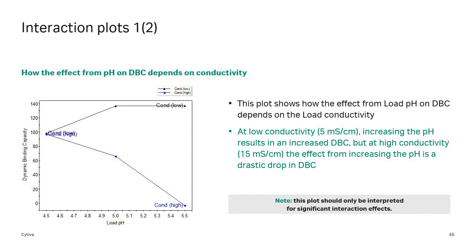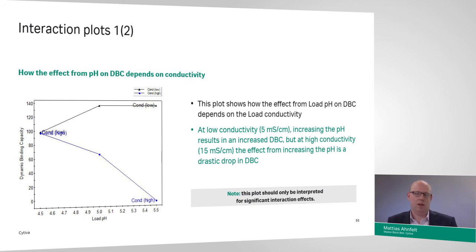So we know it's not going to be the lowest pH, lowest conductivity that is the best. We know there's going to be a sweet spot somewhere a little bit higher on either pH or conductivity. And we can quantify that by the DoE approach.